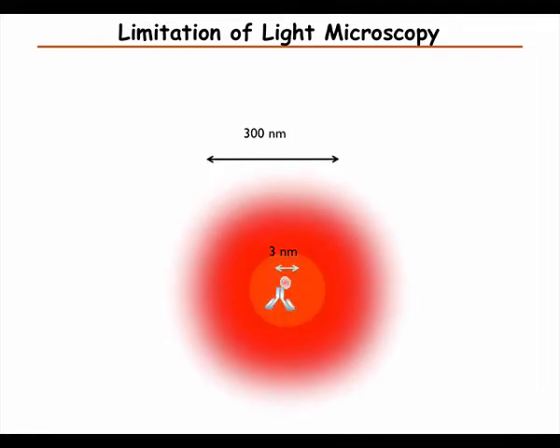But we have this limitation that, depending on the wavelength, we can't resolve objects that are smaller than the wavelength.